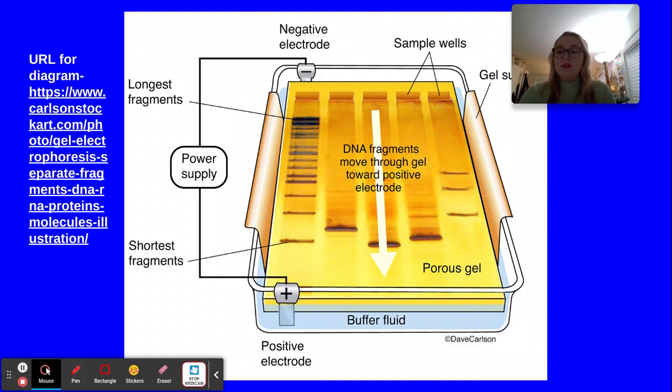Usually, an analyzer will be given 3 or more samples of DNA. One of the samples will be the suspect's DNA, and the others will be samples of DNA from the crime scene. Then, using a restriction enzyme, the analyzer can evaluate if the identification points are similar to the suspect's. The results can then be used in trials.